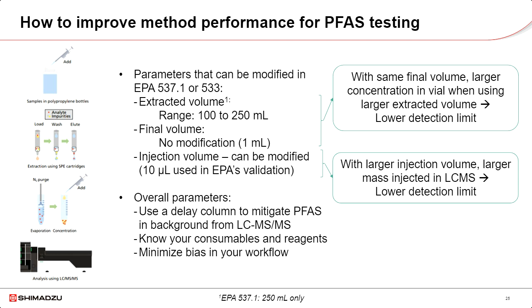So if you use a larger sample volume, you are going to have more mass going to the detector, and that translates into lower detection limits.